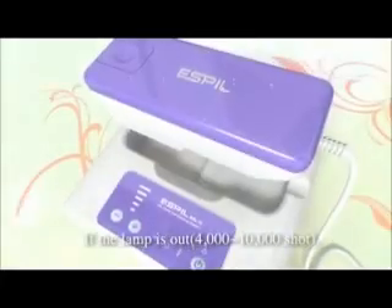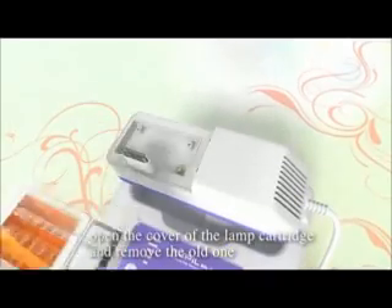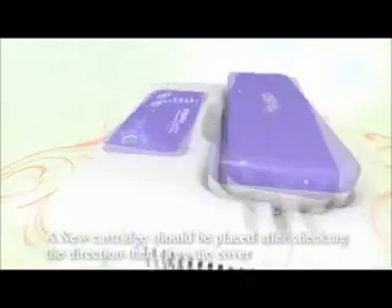If the lamp is out, open the cover of the lamp cartridge and remove the old one. A new cartridge should be placed after checking the direction. Then close the cover.